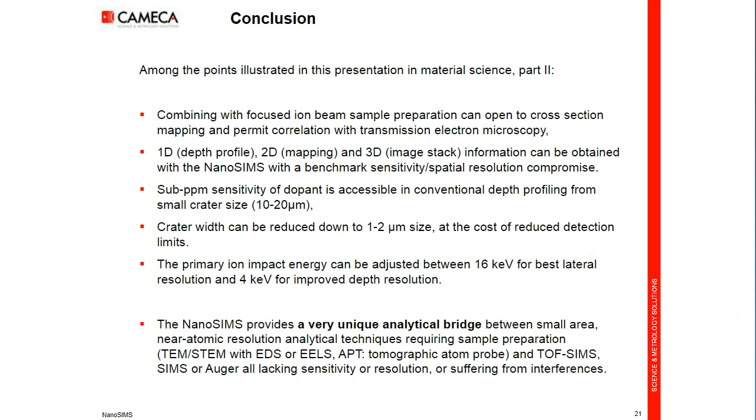And also between other conventional analysis methods like time-of-flight SIMS, magnetic sector SIMS, or Auger, all lacking either sensitivity or lateral resolution, or suffering from interferences, for example, quadrupole SIMS.